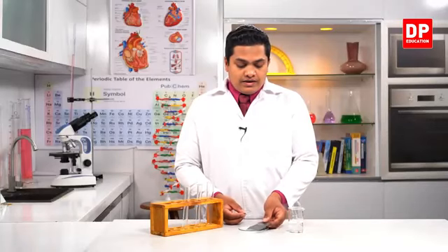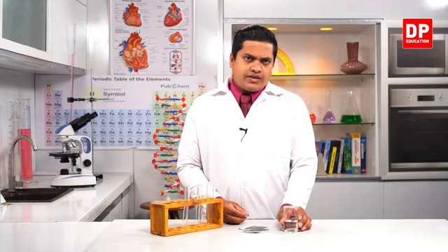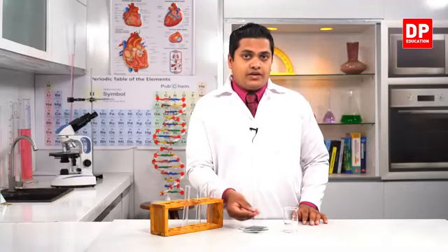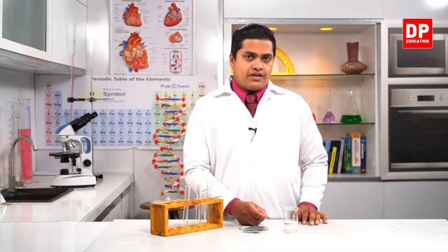And now in my left hand side on the beaker with me, I have somewhat diluted sulfuric acid. Okay, so this is diluted sulfuric acid and this is the piece of zinc. Now what I'm going to do is add this zinc piece into the diluted sulfuric acid. So we'll see what observations we can get from the experiment.